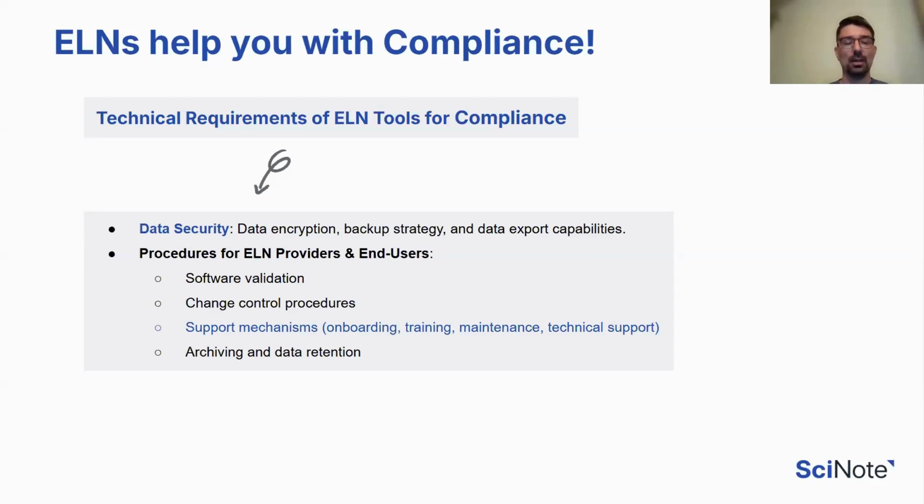So the support aspect of electronic platforms. This is really varied; vendors typically have very varied levels of support for their customers. And with this, I mean the onboarding to the tool, the training about the tool, maintenance of the tool, helping transition from the previous system to the new system, technical support. And this is, I think, a very key thing that can make or break the adoption of any digital platform, including the ELNs. And here I would strongly suggest that whenever you are assessing certain vendors for ELN, this is something that has to be checked quite thoroughly.